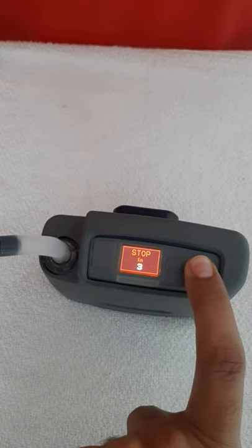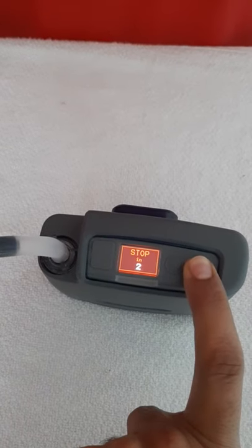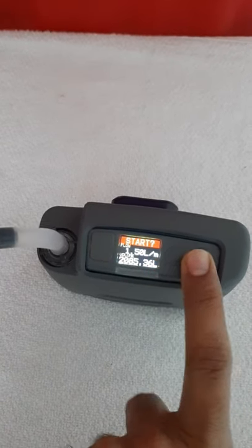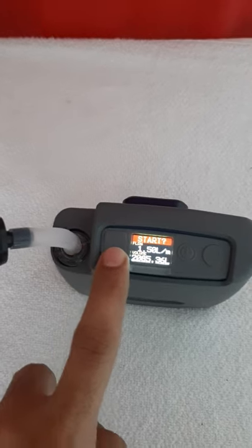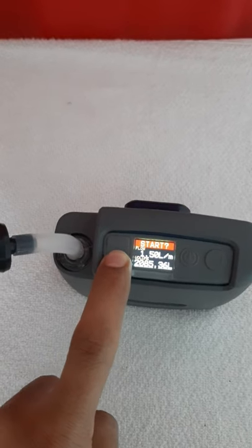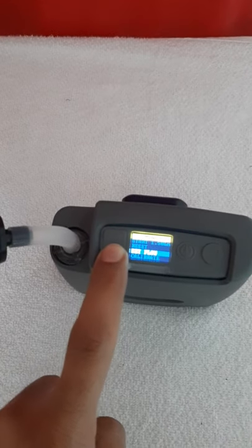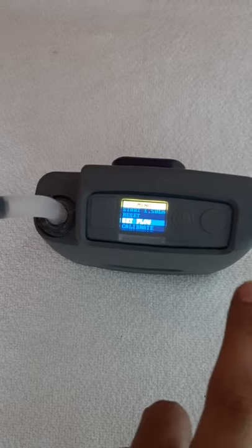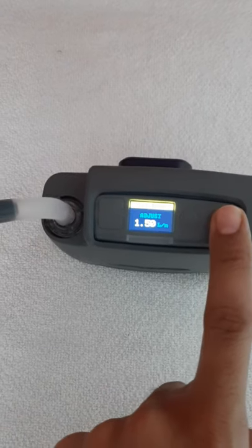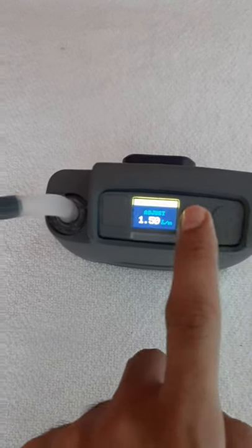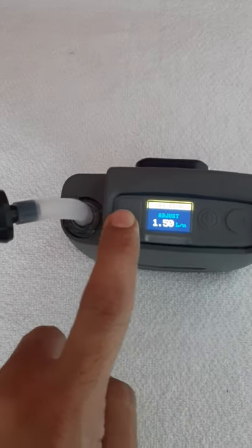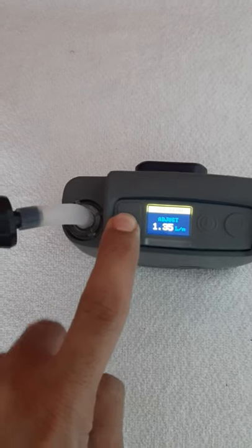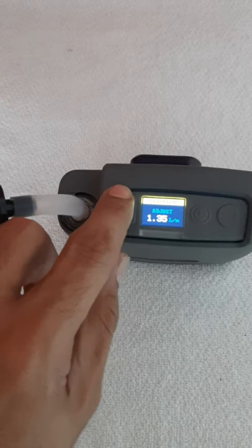Go to flow setup. This is what you see to set up the flow. Click on setup flow. If you want to adjust, you can adjust the flow rate.